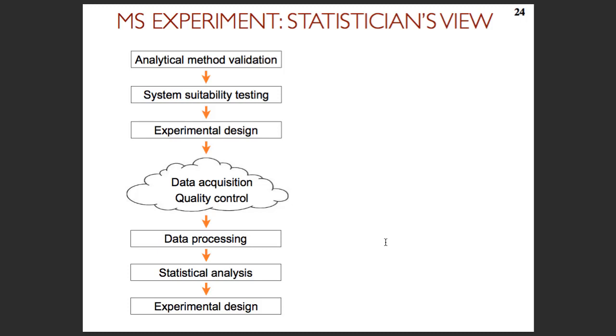So sometimes it's not very obvious. For example, MaxQuant doesn't give us the output in a way which is just like you take this file and you read it in R. So we actually had to develop converters which extract the relevant information from various files in MaxQuant. But it can be done, and it was done. So sometimes it's just an export, sometimes it's a converter, depending on the tool. But as far as we can, we work with the developers of many tools, including, for example, Biognosys, Spectronaut, we work very closely with them. DIA-Umpire, we work very closely with the developers as well. So we try to make it as streamlined as possible.